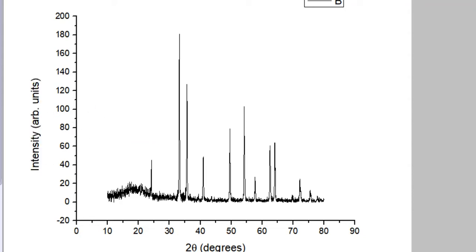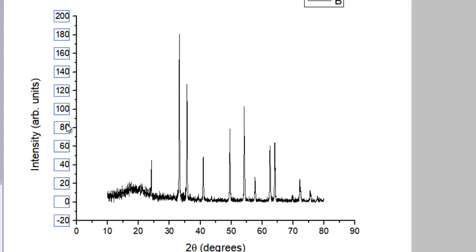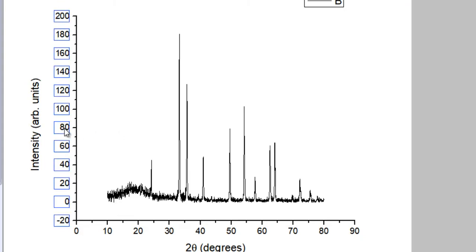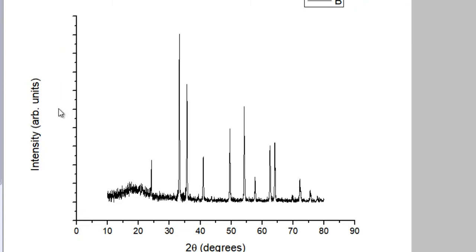Now that both axes are labeled, you may want to get rid of the numerical tick labels on the Y axis, because intensity is measured in arbitrary units — the highest peak is scaled to 100 and all other peaks are scaled relatively. These values don't offer useful information, so just click on them and press Delete to remove them.